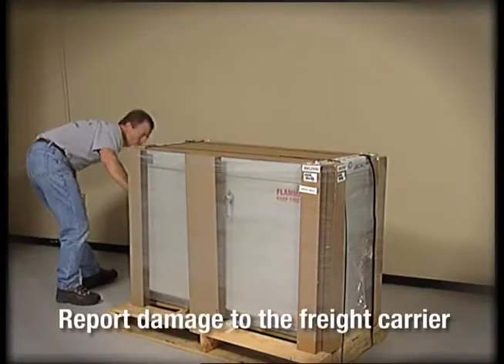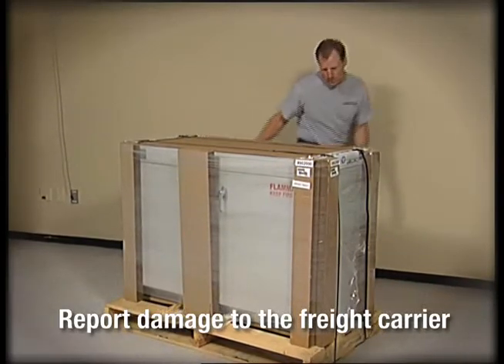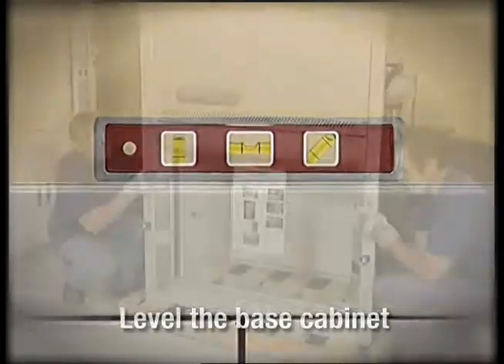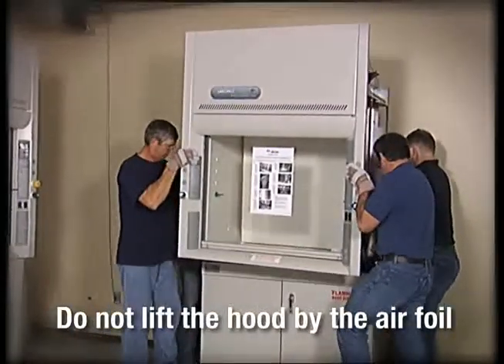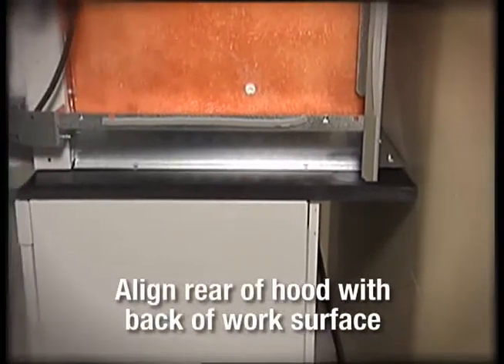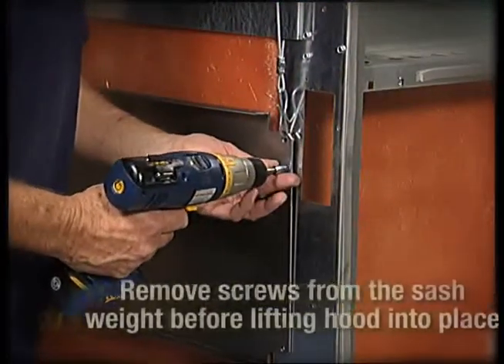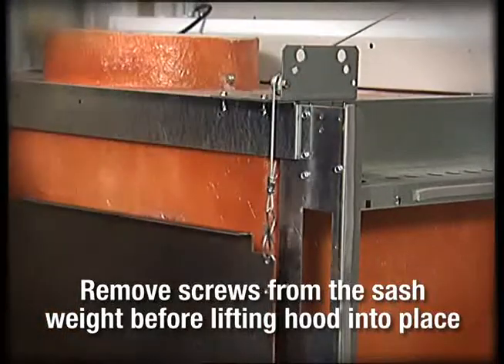Remember to inspect the carton and products and report any damage to your freight carrier immediately. Leveling the base cabinet is essential for proper hood operation. When lifting the hood superstructure, avoid lifting by the airfoil. Align the rear of the fume hood with the back of the work surface to provide the appropriate overhang at the front of the hood. The sash weight is secured to the back of the hood for shipping — be sure to remove the screws before lifting the hood into place.